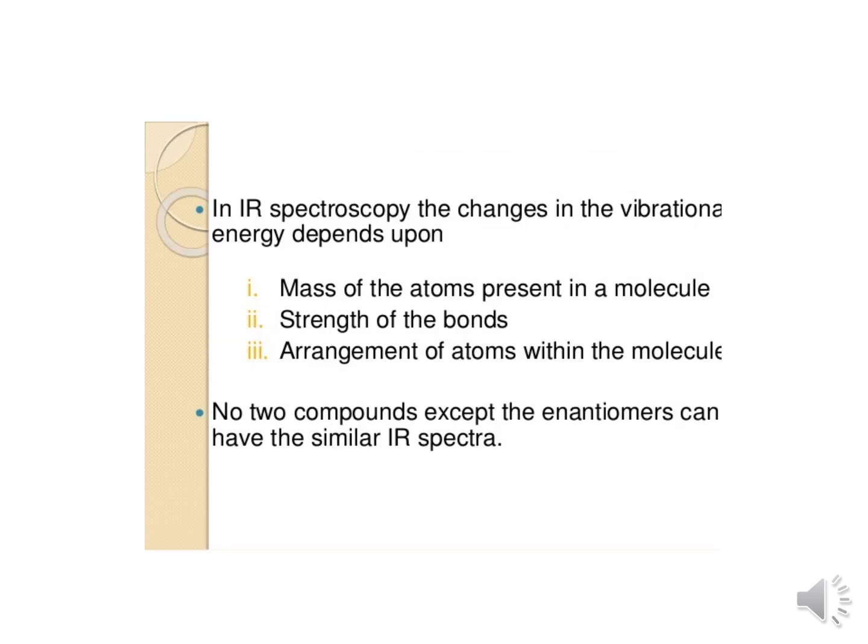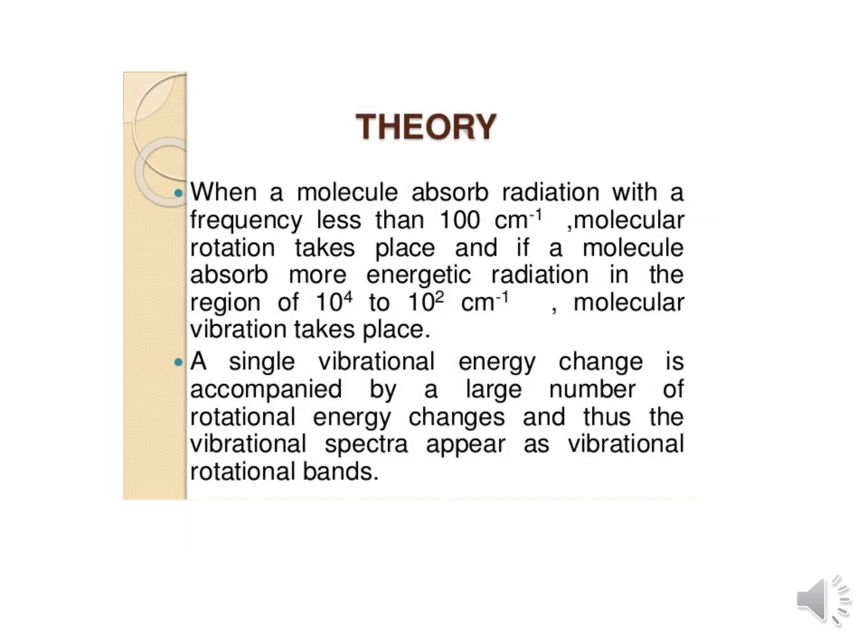In IR spectroscopy, the changes in the vibrational energy depend upon three factors. One is the mass of the atoms present in a molecule, second is the strength of the bonds, and third is the arrangement of atoms within the molecule. So this is the theory of IR spectroscopy.